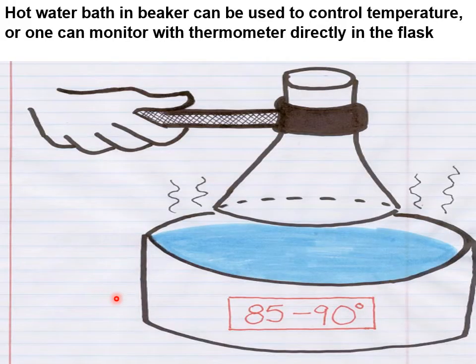Now, when you're heating your reaction, you could place it directly on a hot plate, but there's another method you could use to have better control of the temperature. You can use a hot water bath. You just place your flask into the hot water bath and let it boil in there. Of course, it has to be clamped. And as well, you have to monitor the temperature of the reaction, because it needs to stay around this temperature. You could either place the thermometer in here or even directly inside of the flask. This is just to make sure that you have the right temperature, because sometimes placing things directly on a hot plate can cause them to become too hot. So that's the reason.